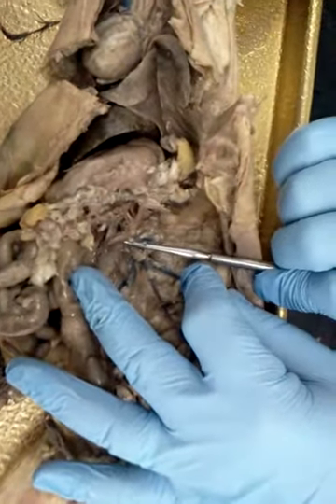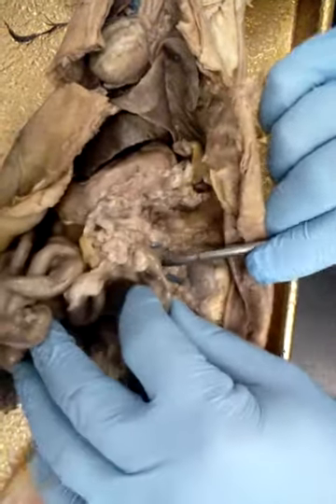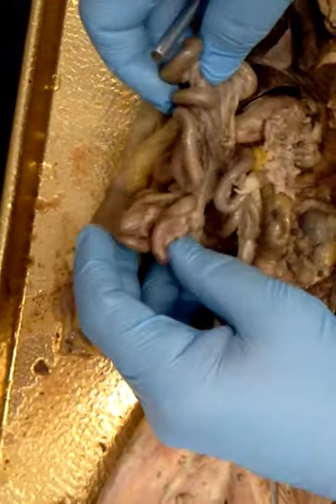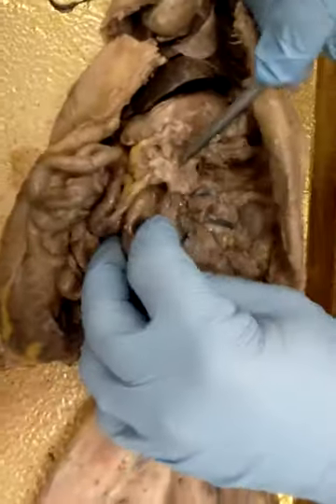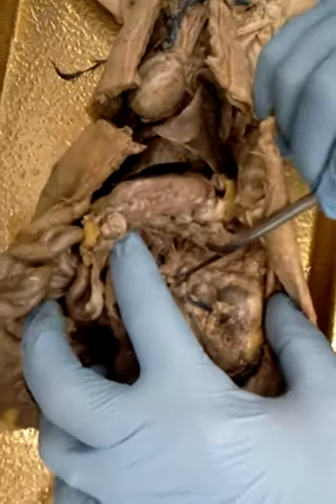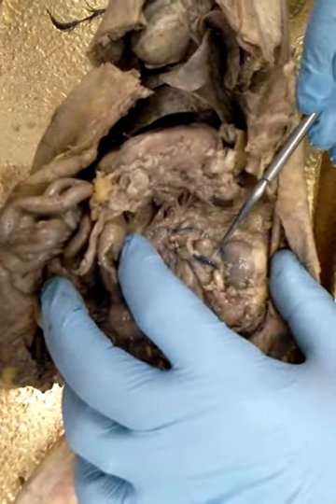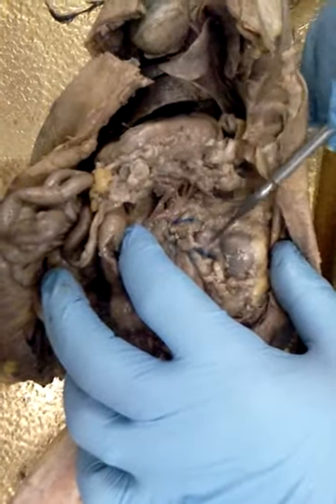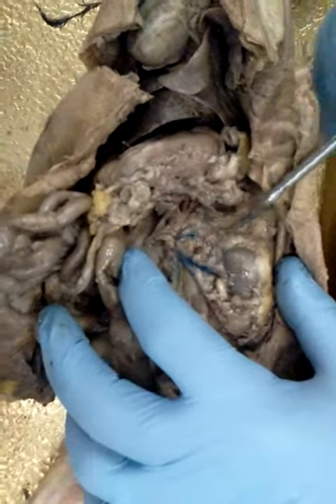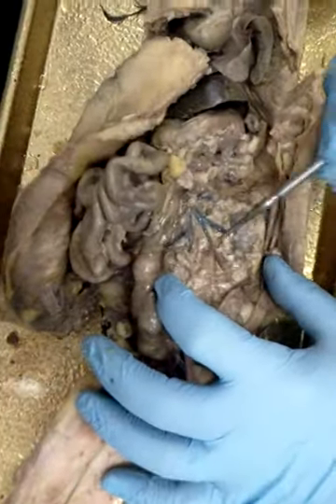Here is the superior mesentery. The superior mesentery goes to the small intestines to feed all of this. All right? There's the superior mesentery. As we go down further, we're going to find the renal vein and the renal artery. It's going to be right next to it. Very large. As we go down further, we'll come to the gonadal.